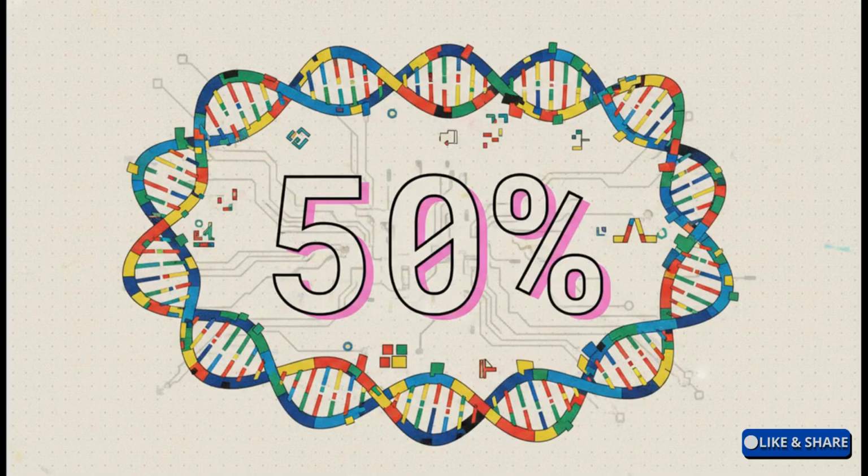Hitting that 50% cumulative threshold efficiently, that is the ultimate indicator of a perfectly reconstructed biological map. When half of your entire genomic dataset is locked up in massive, unbroken stretches of DNA, you know you've successfully navigated the whole computational maze of repetitive sequences and formatting errors.